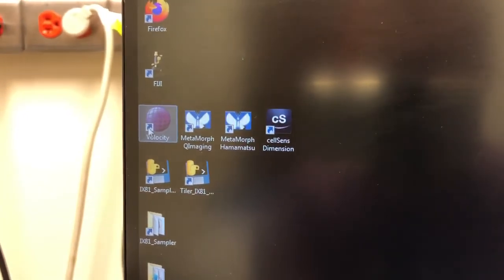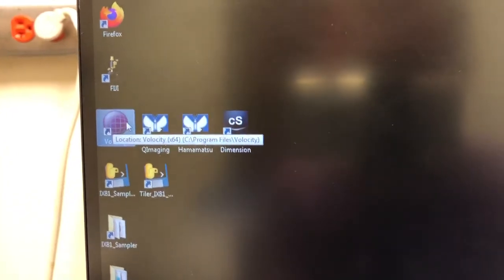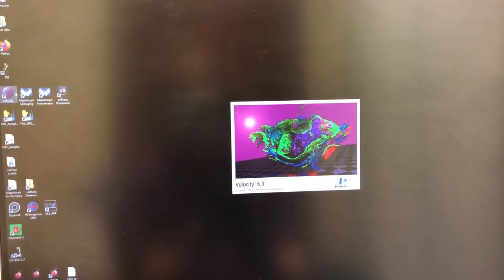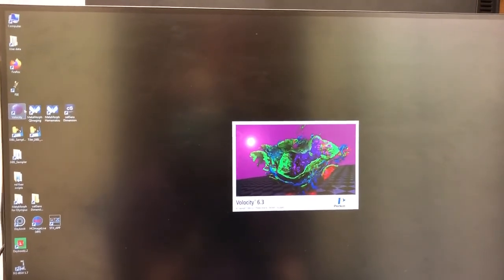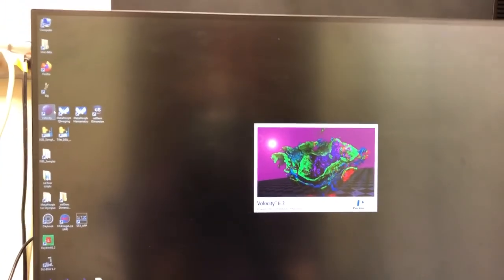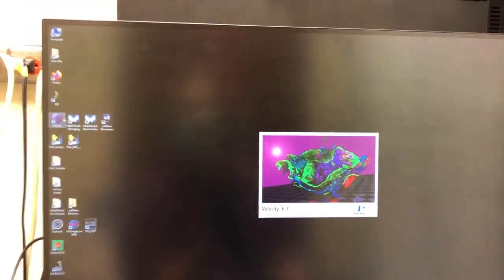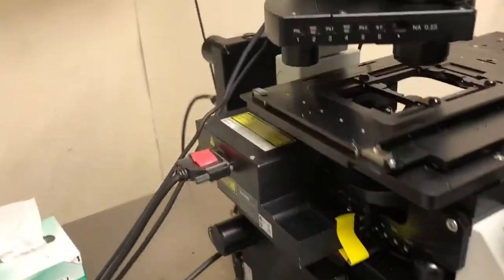The computer has started up. You'll see there are two users: LUNA and MSL admin. Click on LUNA; the password is 'msl', all lowercase. For bright field, I recommend you use Velocity — let's double-click on it. If you are already a user of the BX61, this use of Velocity for bright field imaging is very similar, with only minor differences in the software.